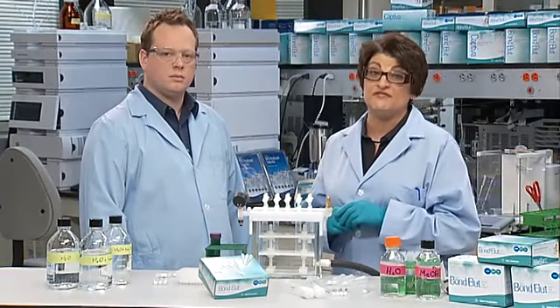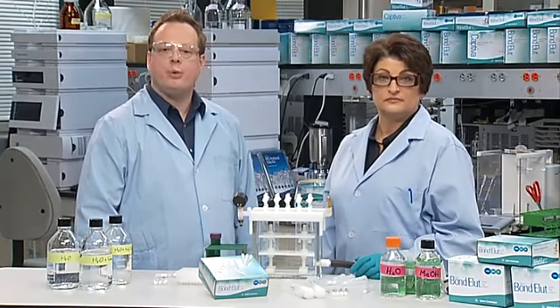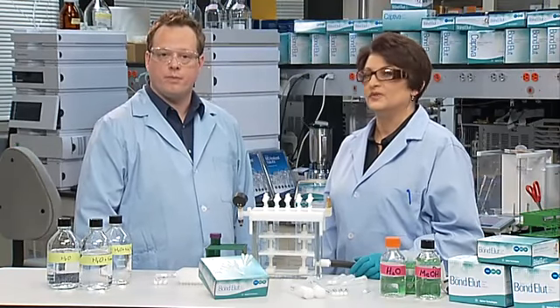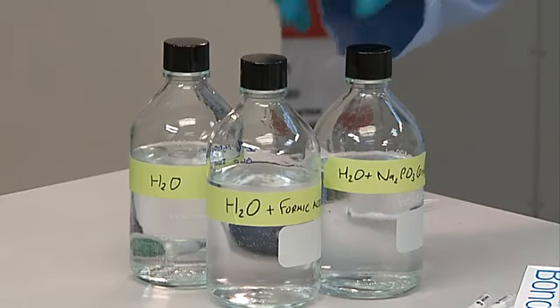This will have a negative effect on the next step, loading. In general, polymeric SPE material is not affected by drying out, but on the other hand, will benefit from improved flow when properly conditioned. After the SPE material has been activated with the organic solvent, we will need to equilibrate with an aqueous solution. We can use an aqueous solution such as water with modifier, or a buffer solution. The organic environment needs to be displaced with an aqueous solution so that the particles can interact with the sample, which is established in this second step.